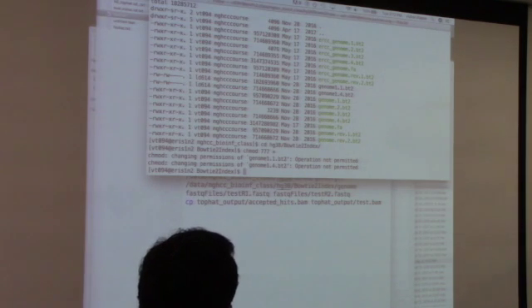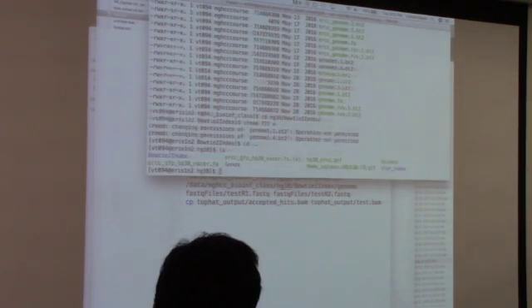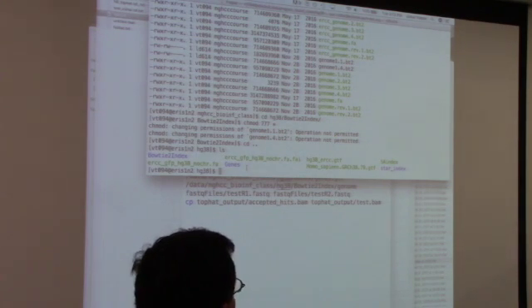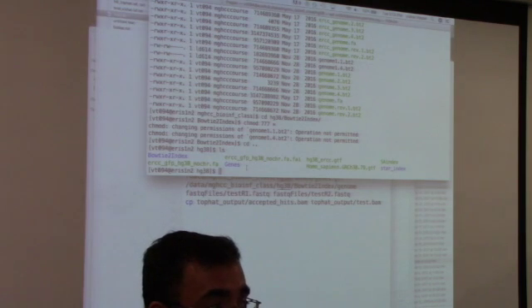Alright, let's ignore these two for now. So in this directory, it's not just the index for Bowtie 2, it also has a STAR index, your human genome GTF, and some other GTFs and FASTA files as well. So when you copy this folder, just know it'll occupy a lot of space. Don't copy it again and again in multiple locations. Just copy it once, and wherever you choose that location to be, that's where you're going to use it from for the rest of the course. Does that make sense? Okay.